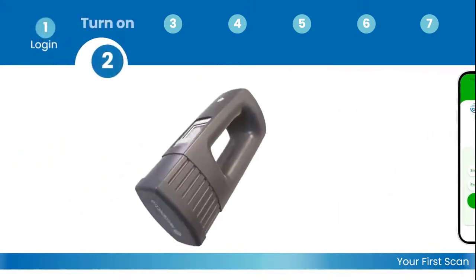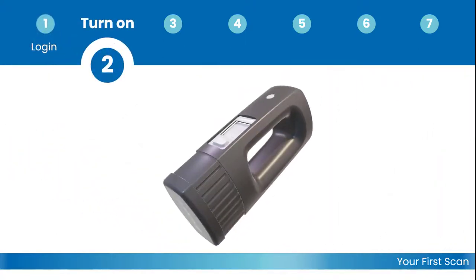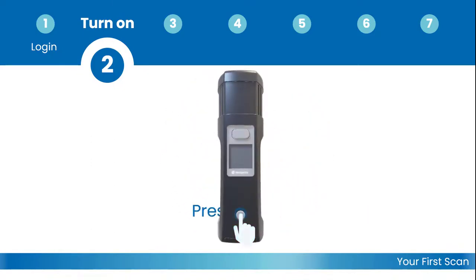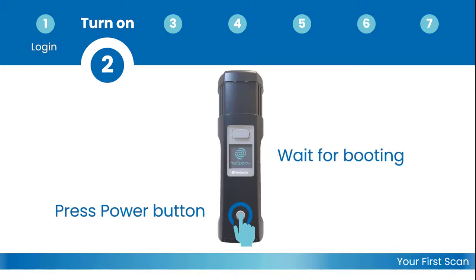Now, let's return to your scanner. Your scanner will arrive charged and ready to go right out of the case. To turn it on, press the power button. You should see the scanner screen panel light up. Wait until the display indicates that it is ready for use.